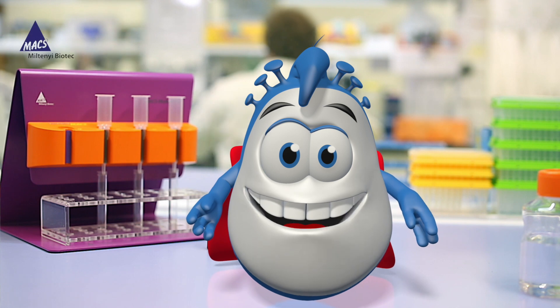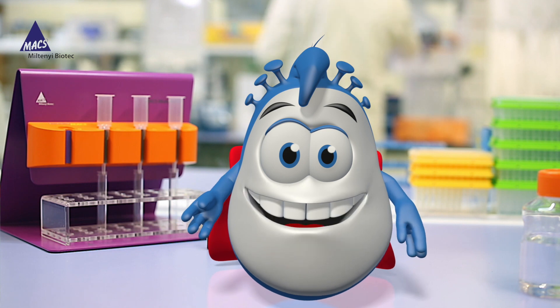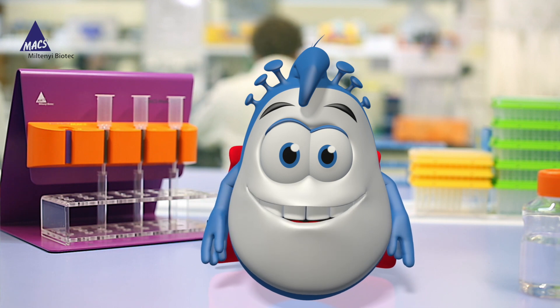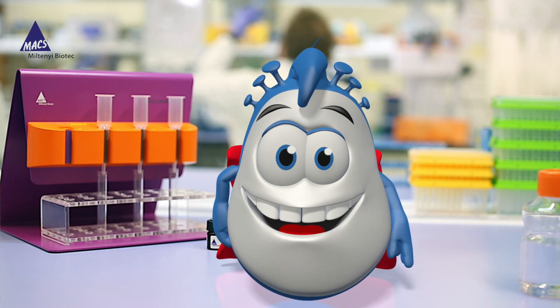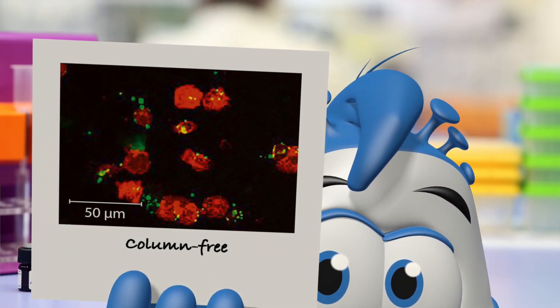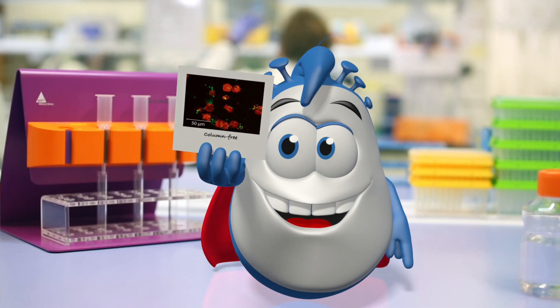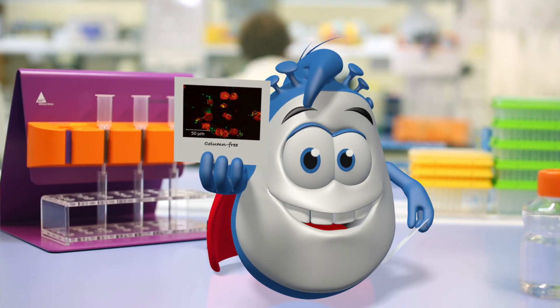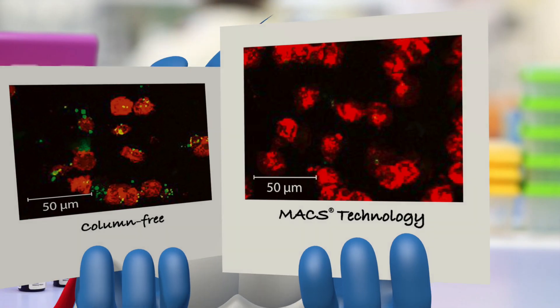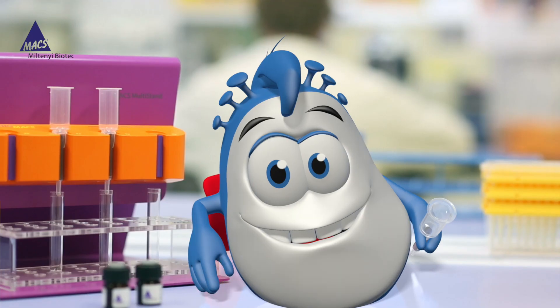Do you want to go for a depletion strategy in which you label all the unwanted cells and leave your cells of interest untouched? Be aware that there is no guarantee for unlabeled target cells when using a column-free technology. This immunofluorescent staining of isolated target cells clearly shows a green signal of bead remnants on the cell surface. If you really want untouched cells, check out our microbead-based Max Cell Isolation Kits.